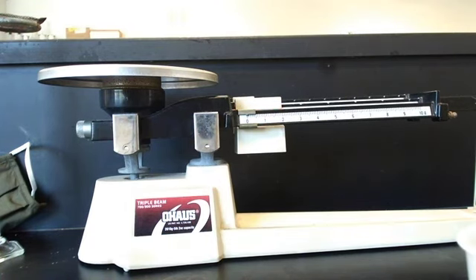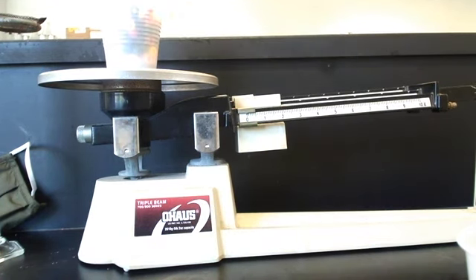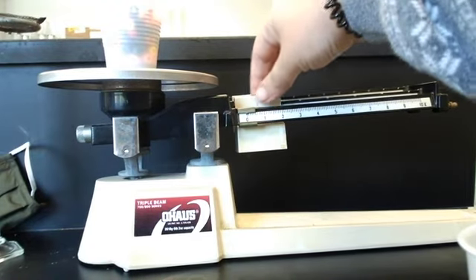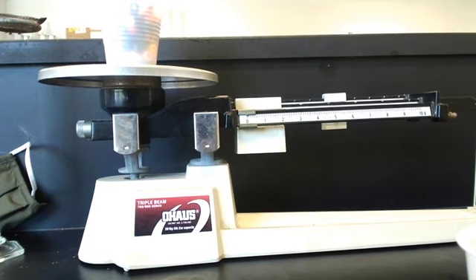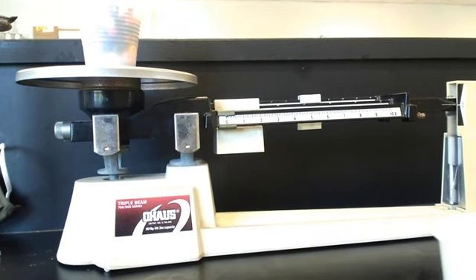Okay, that's enough. So again, my starting mass was 3.6 because it always is. I'm going to start taking the mass of my beads here. At 60, it floats a little bit. This might be one of those situations where it works out perfectly. Oh, look at that. It does. How convenient. Let me show you as proof. Yeah, that's 60 grams. That's convenient for us.